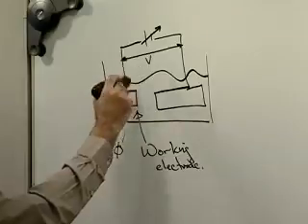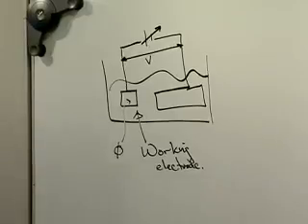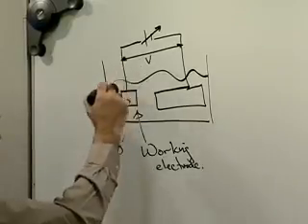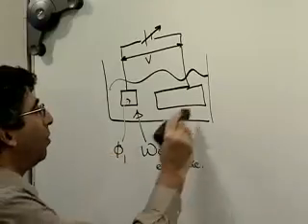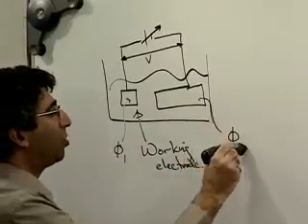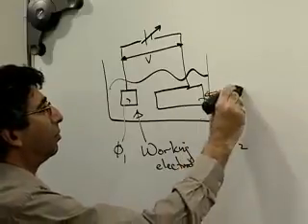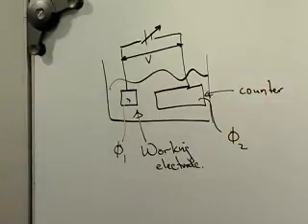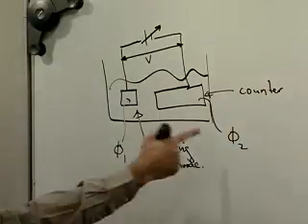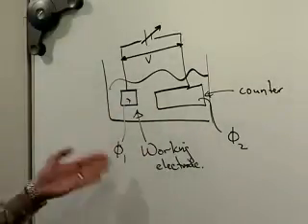Well, one way we might do that is we know what V is because we put it there. And so we might, zeroth order, say, okay, let's assume that the voltage is evenly distributed across these two electrodes. So we have a phi 1 for our working electrode and a phi 2 for our counter electrode. This is counter over here. And so V is just the difference in the potential of those two. And if it was evenly distributed, then phi 1 and phi 2 would be equal.